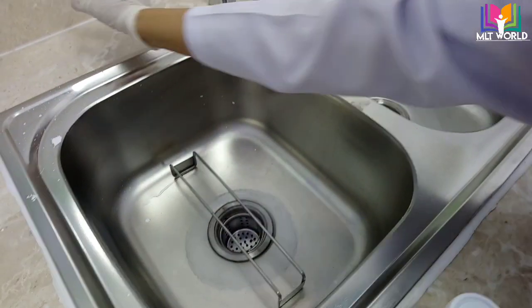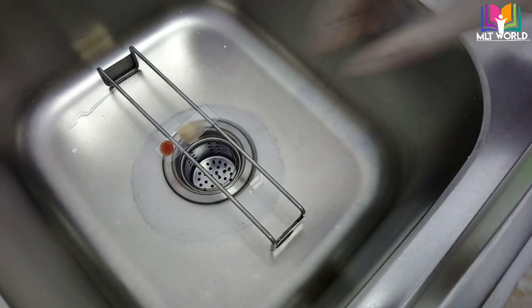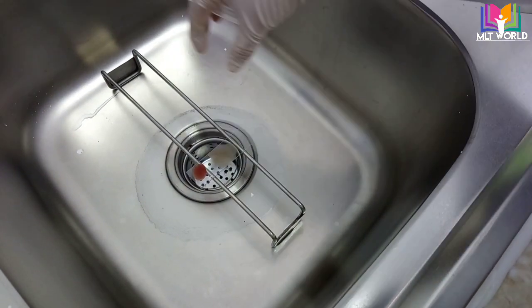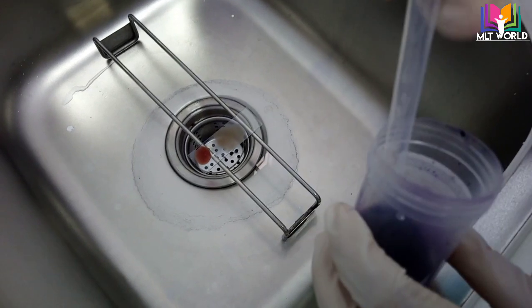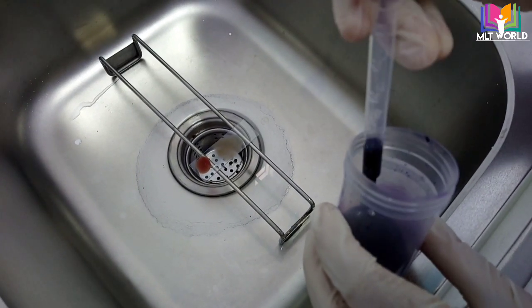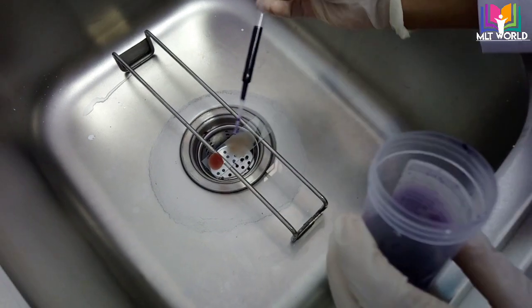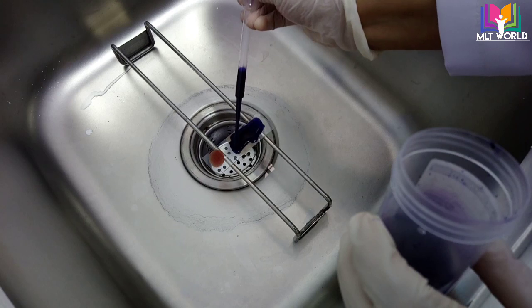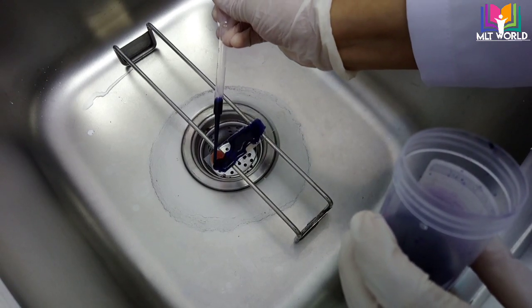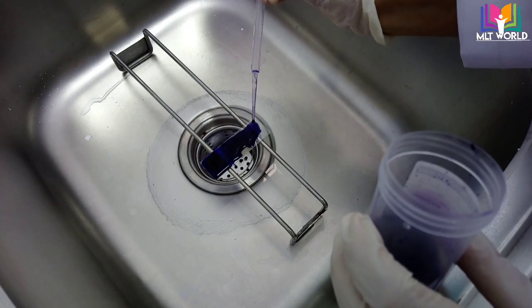Now our slide is dry and fixed. We will cover both the thick smear and thin smear with the stain and then set a timer for 10 minutes. If you have a timer, you can use it; if not, set an alarm on your phone or note the time from your watch.